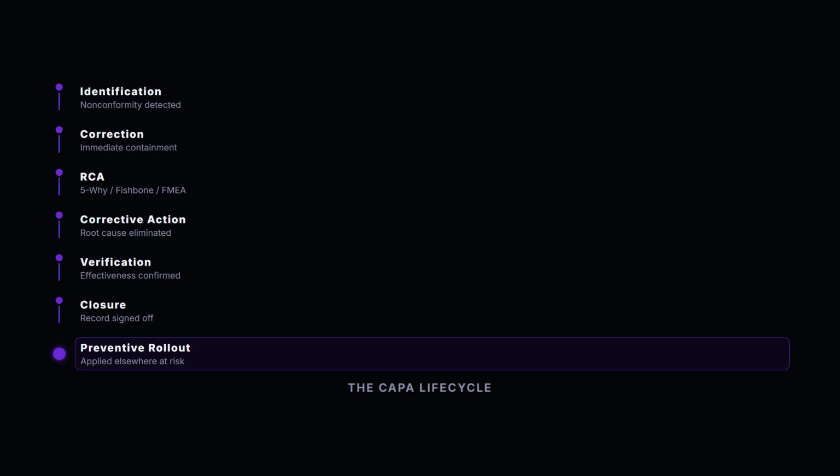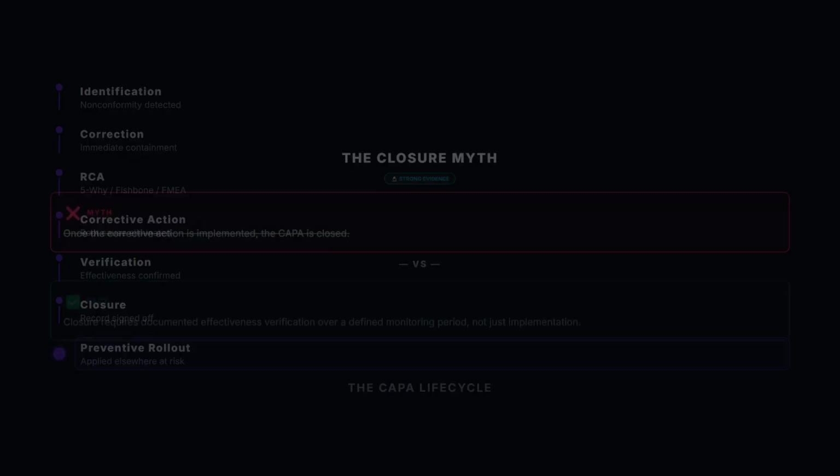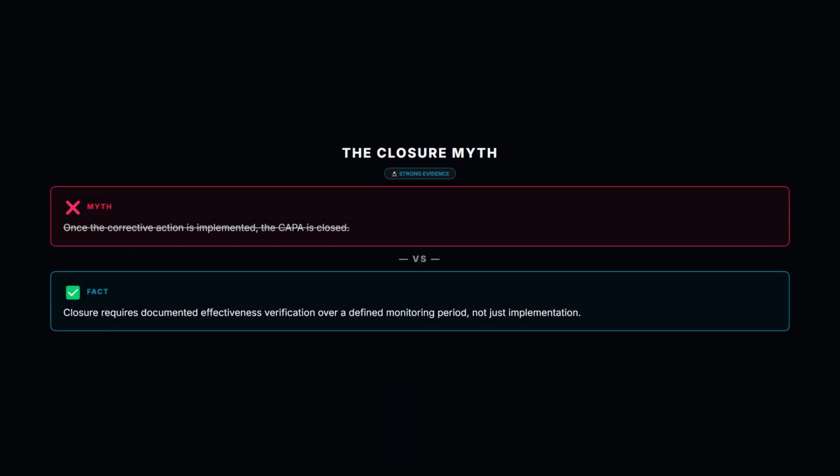One closure myth deserves a direct correction. Implementing the corrective action is not the finish line. ISO 15189 and NABL both expect documented evidence, collected over a defined monitoring period, before you're entitled to mark the record closed. Quality indicator literature consistently shows the same pattern.